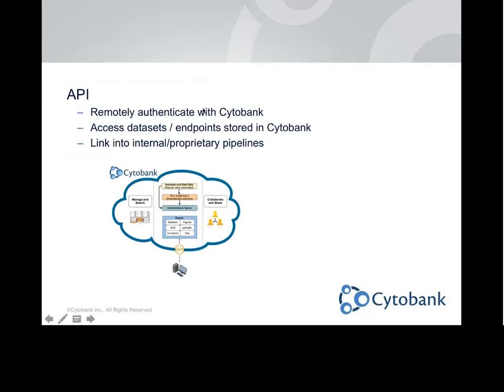And then lastly, we have a Cytobank API that's been recently released. This is more for computational biologists and bioinformaticians, but it's a way to computationally interact with Cytobank. So instead of having to click around in the user interface, you can send Cytobank a script or a list of commands in R, and it will do the work for you.